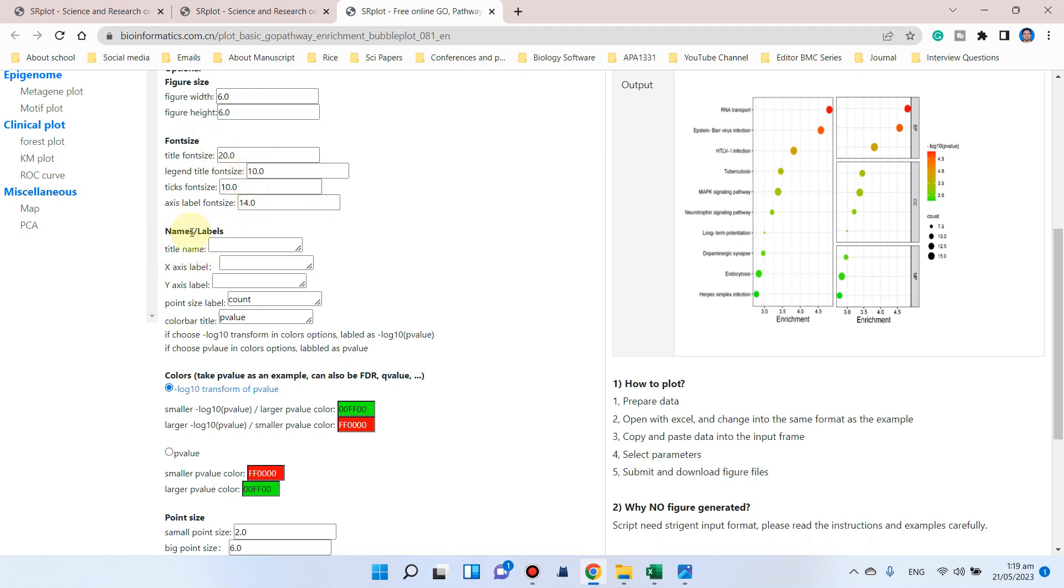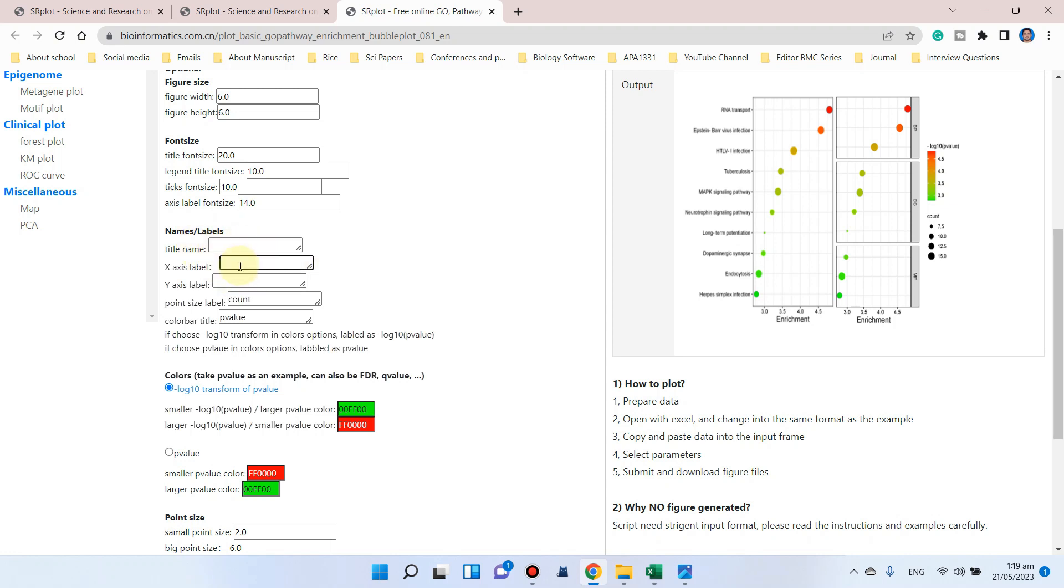Because the x-axis has enrichment score, we can write enrichment score. Oh sorry, this is the title. The x-label should be here, and the y-label is actually the terms.